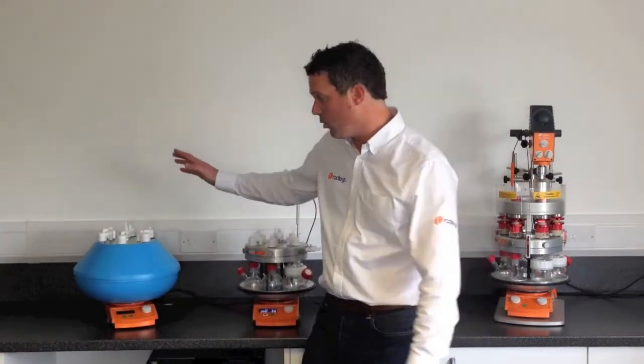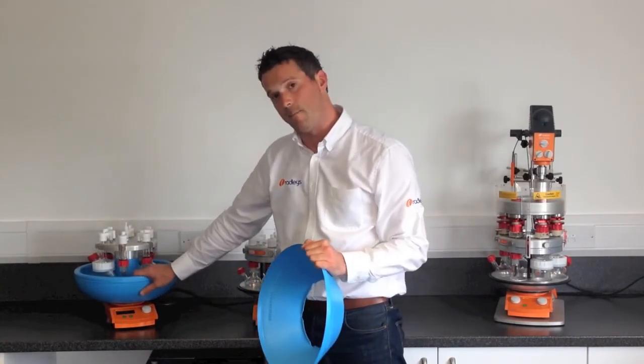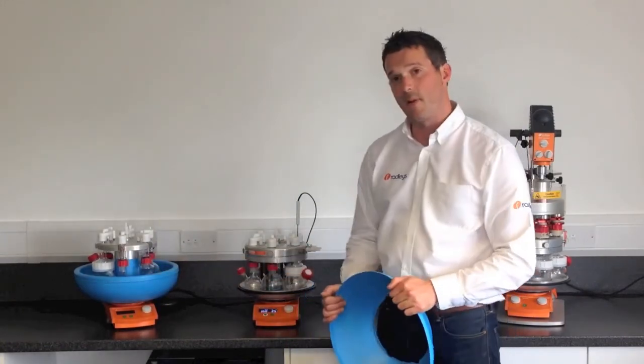If you want to cool your solutions, you can use the Carousel 6 Cooled. This is an insulated bowl that you can fill with dry ice and acetone and use down to minus 78°C. That's the Carousel 6 Plus.